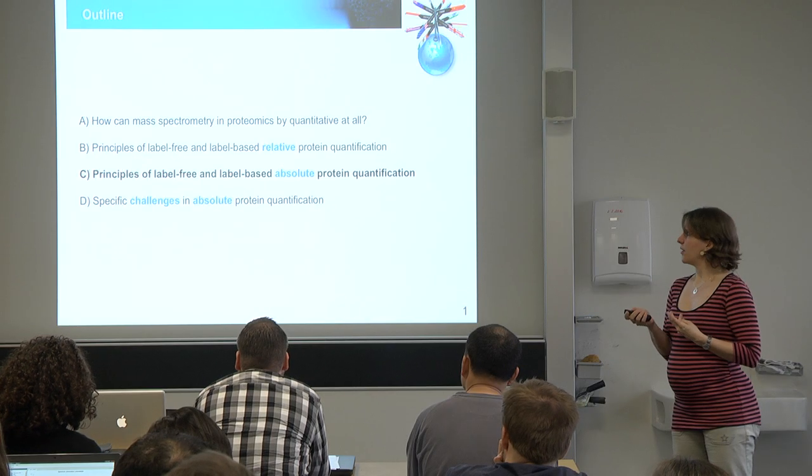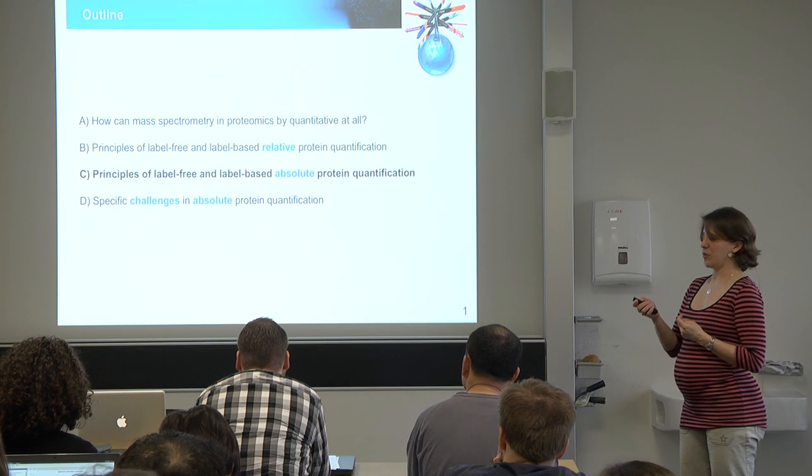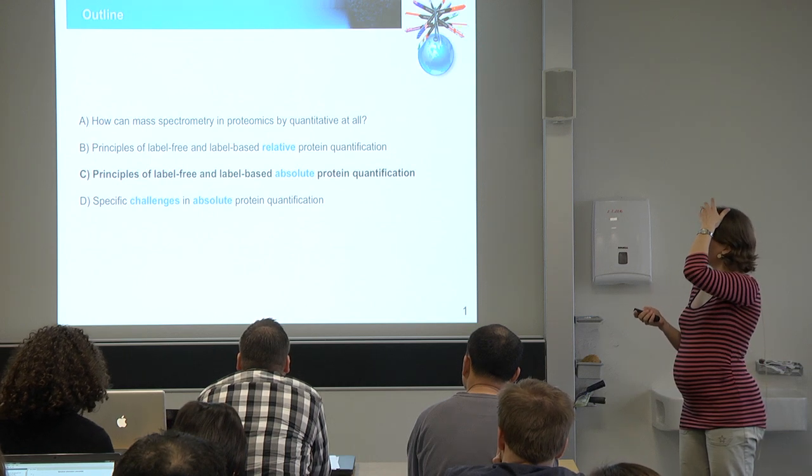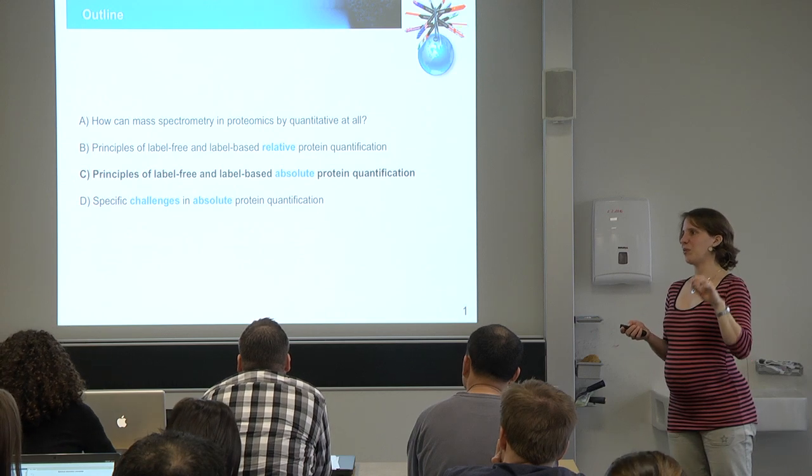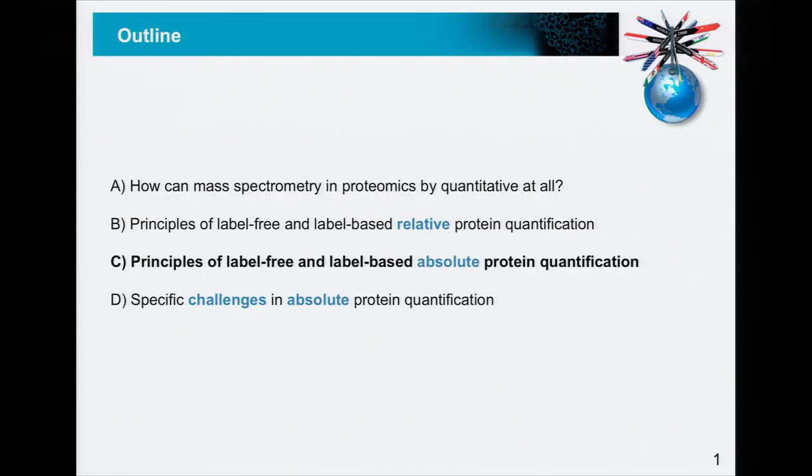That's all I wanted to say on relative protein quantification. Any more questions, comments? Okay, then let's switch to absolute protein quantification. And as I already said in the beginning, absolute protein quantification you should only perform when you need absolute protein quantification. Yeah?